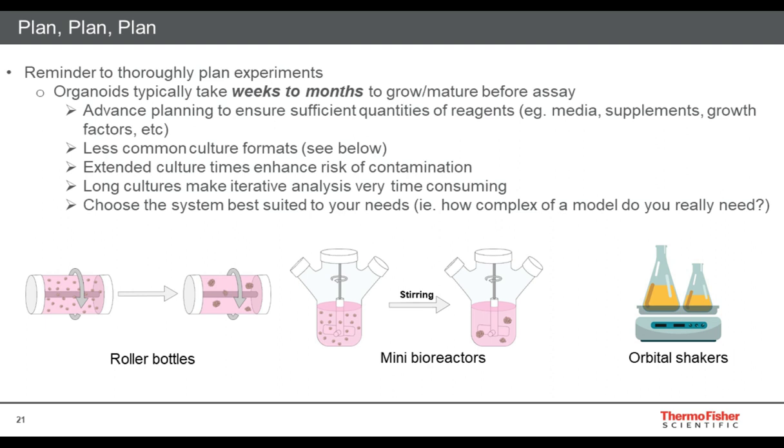model system. So the reason why this is certainly something to plan for is because these things take up different amounts of space in a typical cell culture incubator than simply putting plates on a shelf will typically do. So the space required to grow these is certainly something different that definitely requires planning for, especially if this is not the only thing your lab is doing. You want to maintain space for other experiments that maybe aren't using these sorts of less common culture formats. It does require planning ahead and of course working with your colleagues.